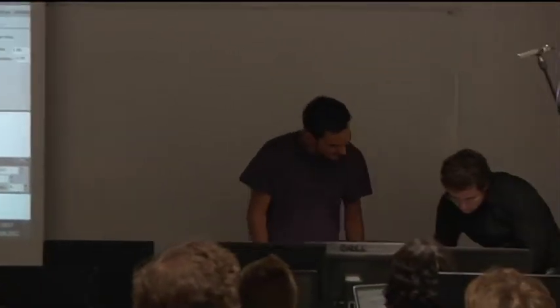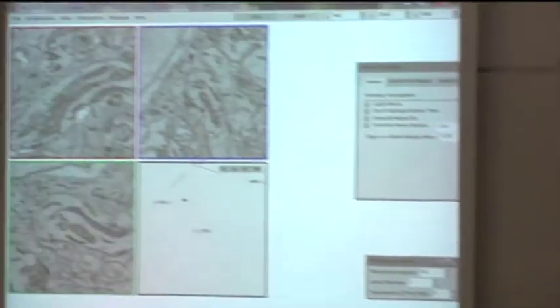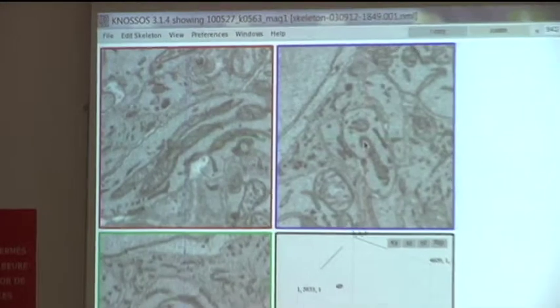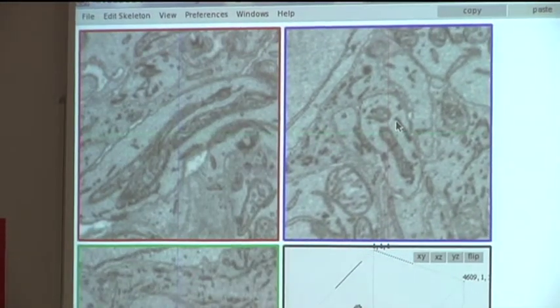Okay, so all you have to do, you look at this window. You press F for forward, D for backward. Just put your two fingers there, and then you can use the mouse to steer. Okay. And just go on this axis. It's mainly going to run on this axis. And if you want faster, tell me. So I'll of course take your time. So at some point there will be a black plane that tells you that you're done. Okay. And then we'll time you.